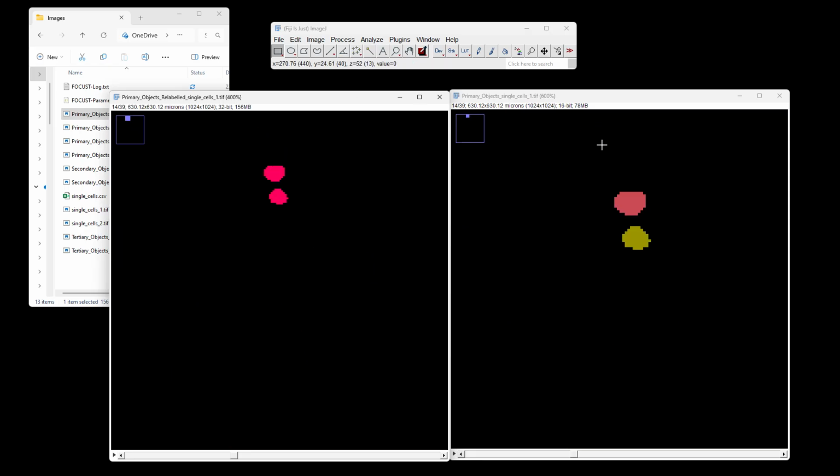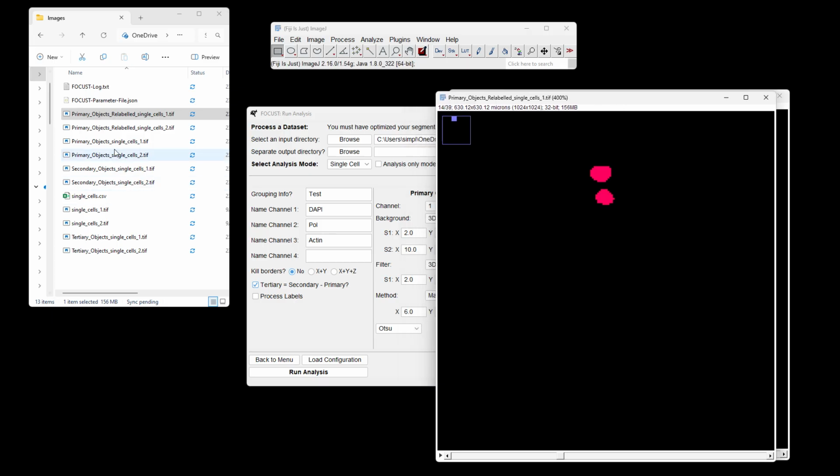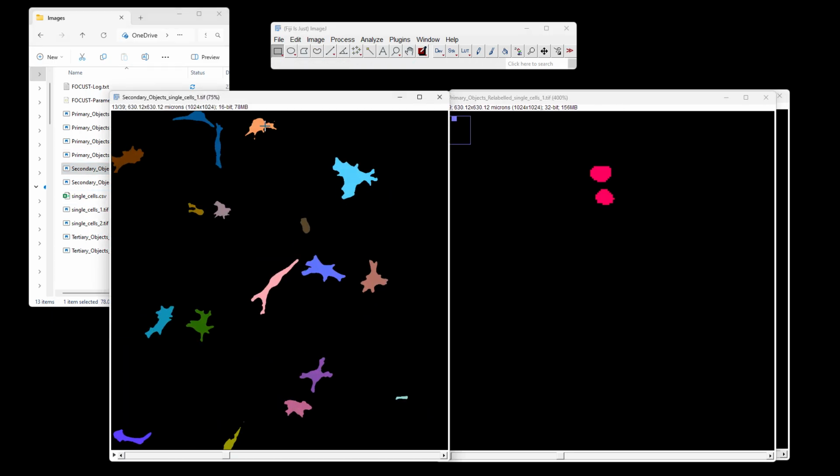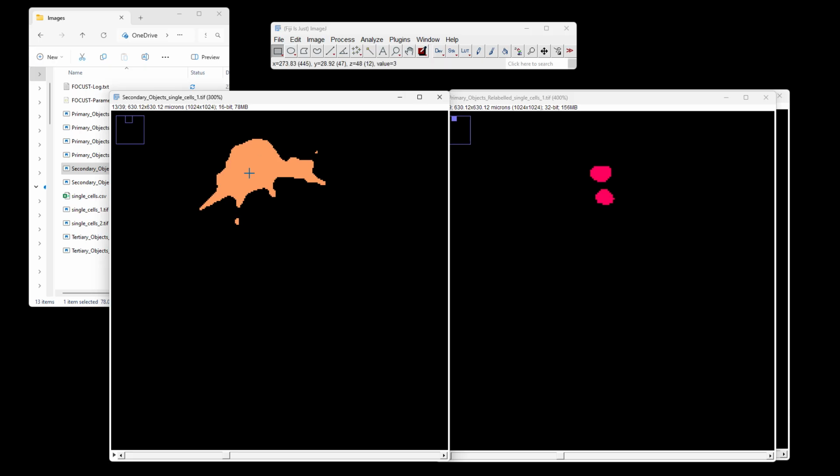So if we zoom into both nuclei here, and again, this top nucleus, looking at the toolbar, is value 20. This one is 27. Now this is value 3 and 3.1, which nicely aligns with the fact that they both were found inside of cell number 3.